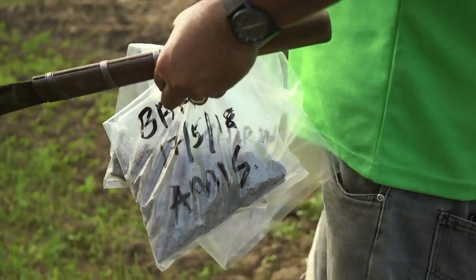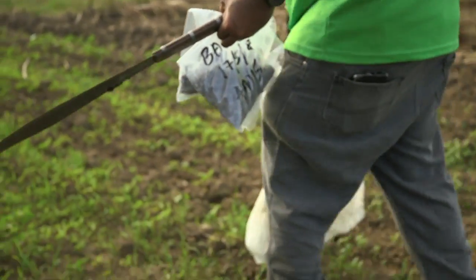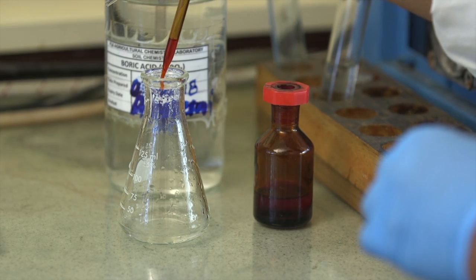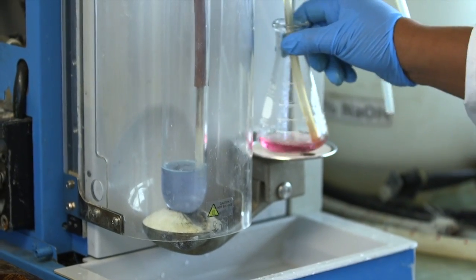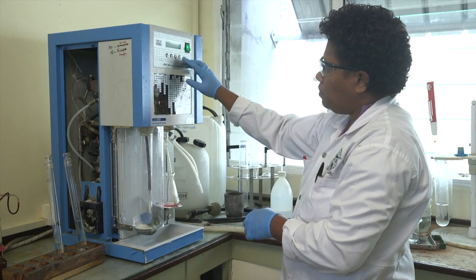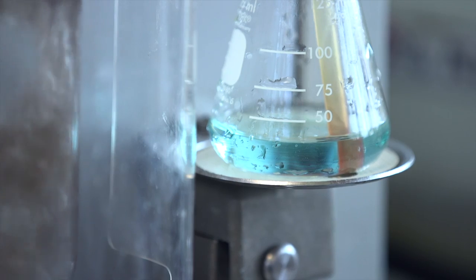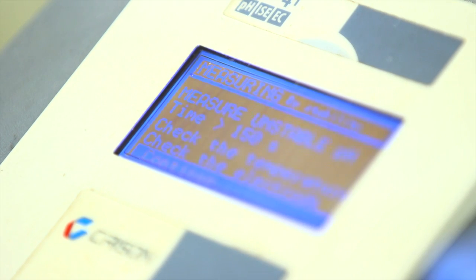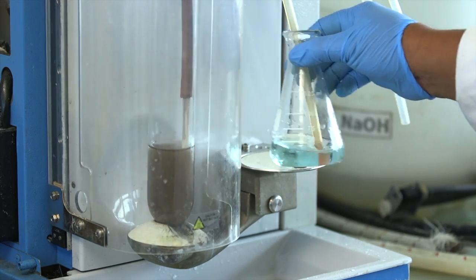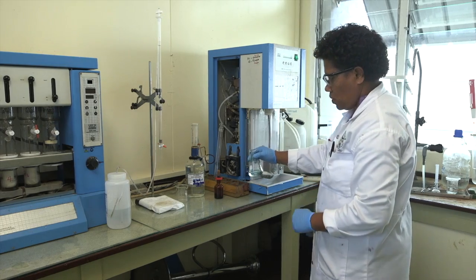Now, once you have collected your soil sample and sent to the ministry, the following tests are done. Electrical conductivity is an indicator of how much salt is present in the soil. Soil NPK is an indicator of the availability of plant nutrients. Soil reaction, or pH, is used to indicate the level of acidity or alkalinity of a soil.